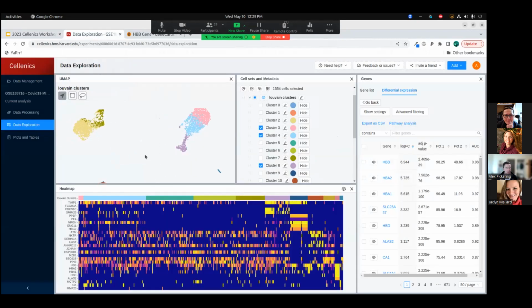One thing that I'll often see in a data set where I'll use that manual selection is, you have this yellow cluster here, and maybe there's some set of cells out here on your embedding that also shows up as yellow. They're part of the same cluster, and they're different. They're out here. Why are they out there?